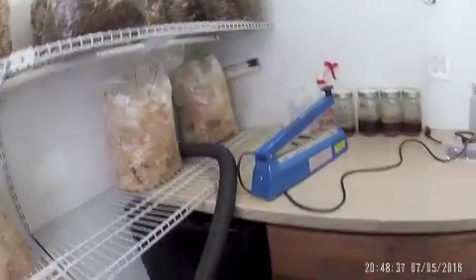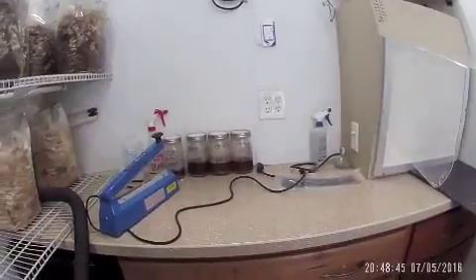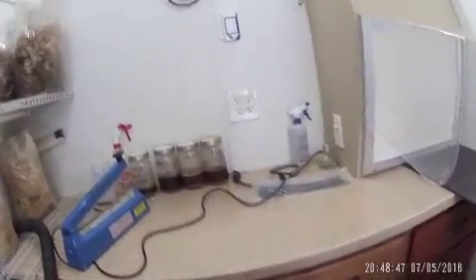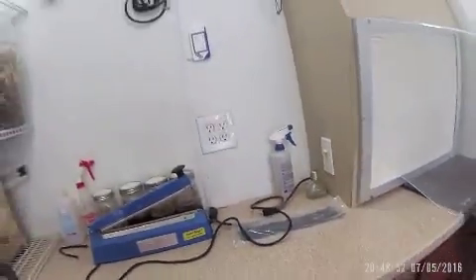Got a small fridge down here, a laminar flow hood. I've got some liquid inoculation stuff, but I've had almost zero luck with that. Got my impulse sealer I use for my bags — I prefer to use that over zip ties or anything else.